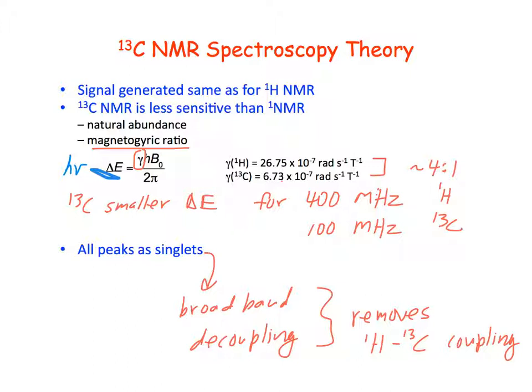So as a little side thing here, why don't we see the proton C13 coupling when we look at a proton NMR spectrum? Because there's not a lot of carbon. Because of the frequency that we're running at, or the scans we're running, we wouldn't be able to register it. Well, what would it look like if we saw C13 coupling between the protons and the C13?